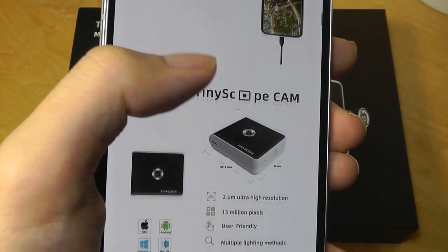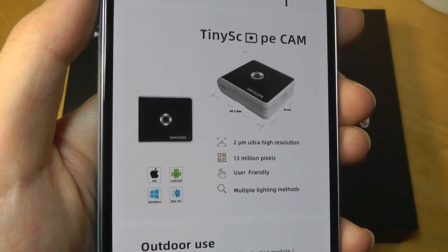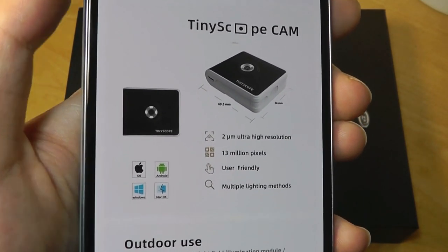So it's ultra portable — you can use it to kind of explore the world around you, kind of a fun novelty item, or you can use it for science classes, for labs, things like that.